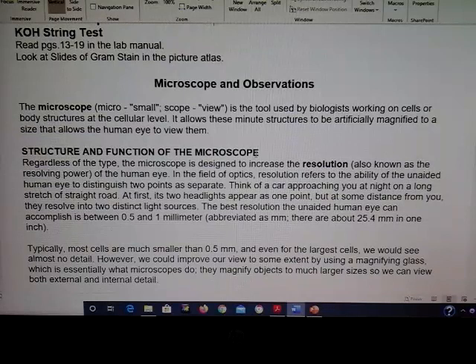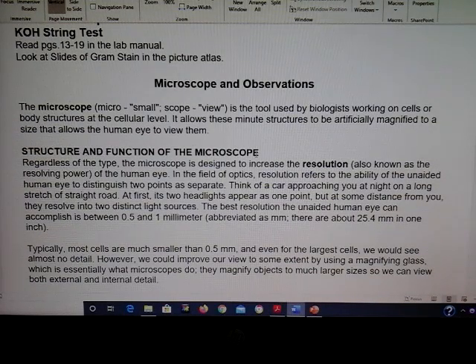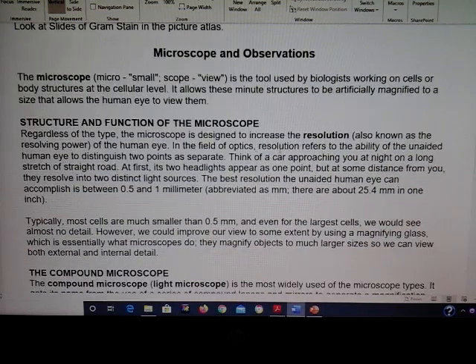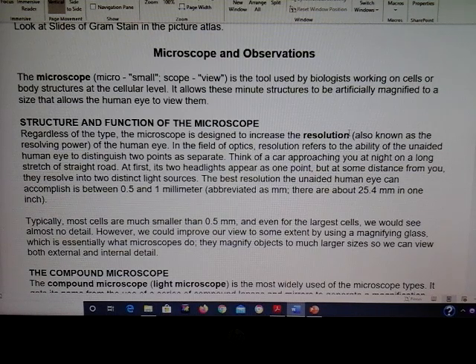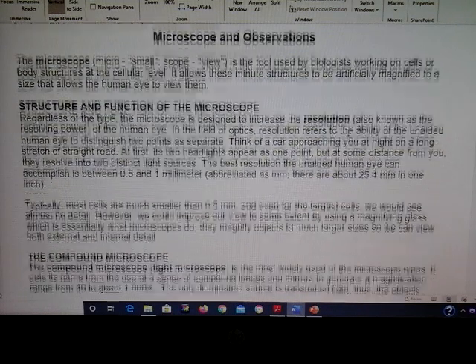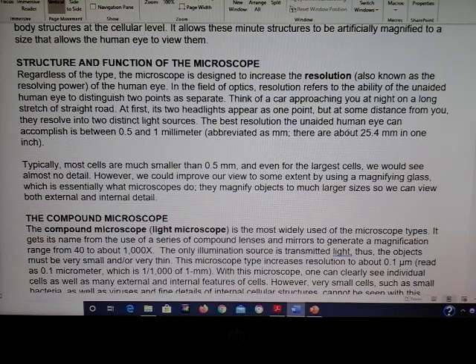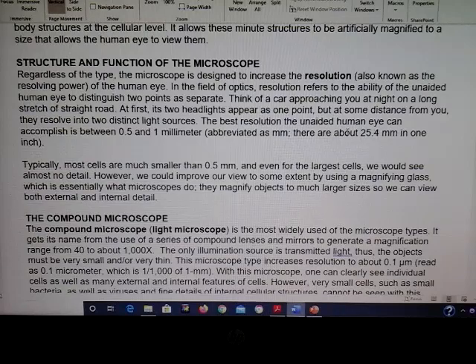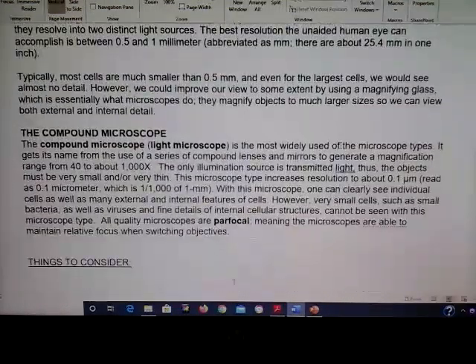There's another video that shows you how to use the microscope, so I won't go into too much detail here. One key goal is to increase resolution — that's the clarity of the image — making it large enough to actually see something. Most bacteria we use are very small, so we have to go all the way up to the oil immersion lens, which is the 100x lens.